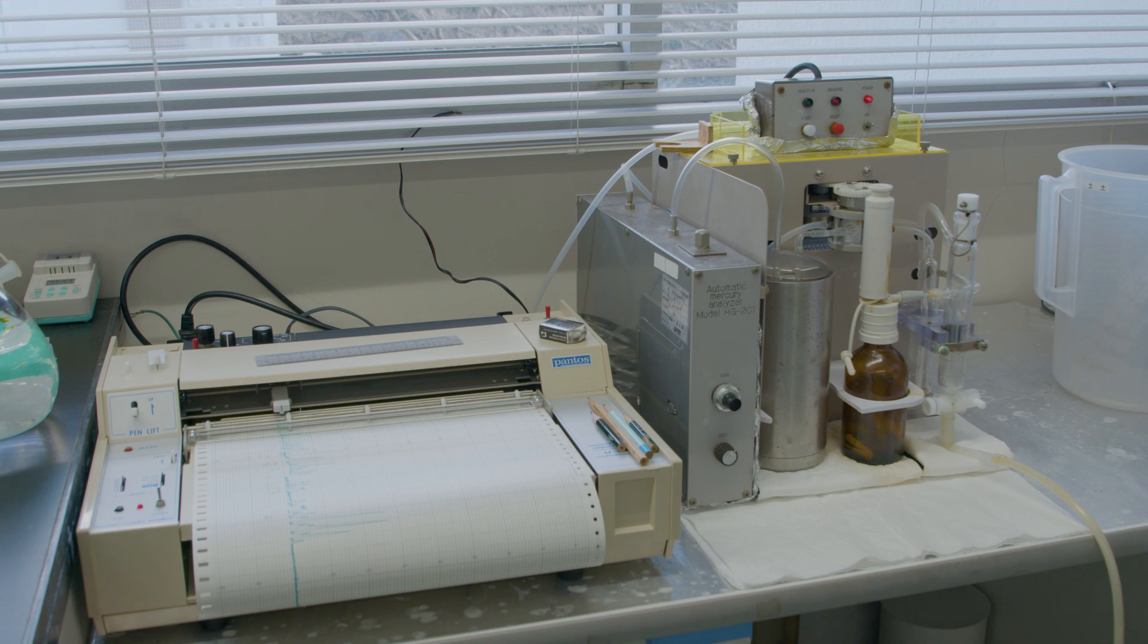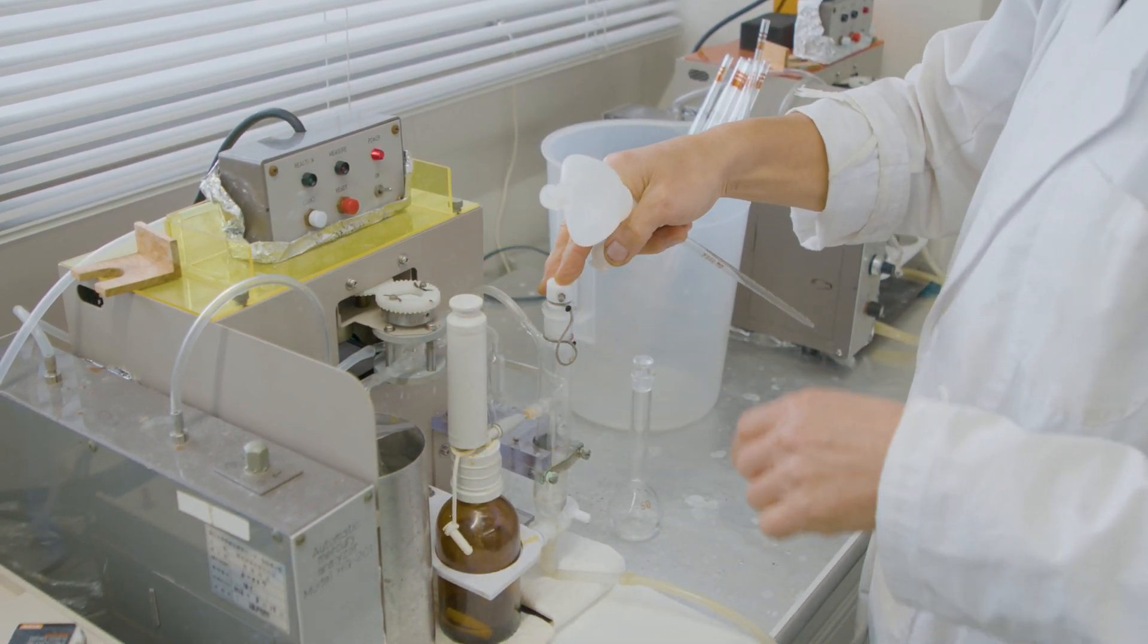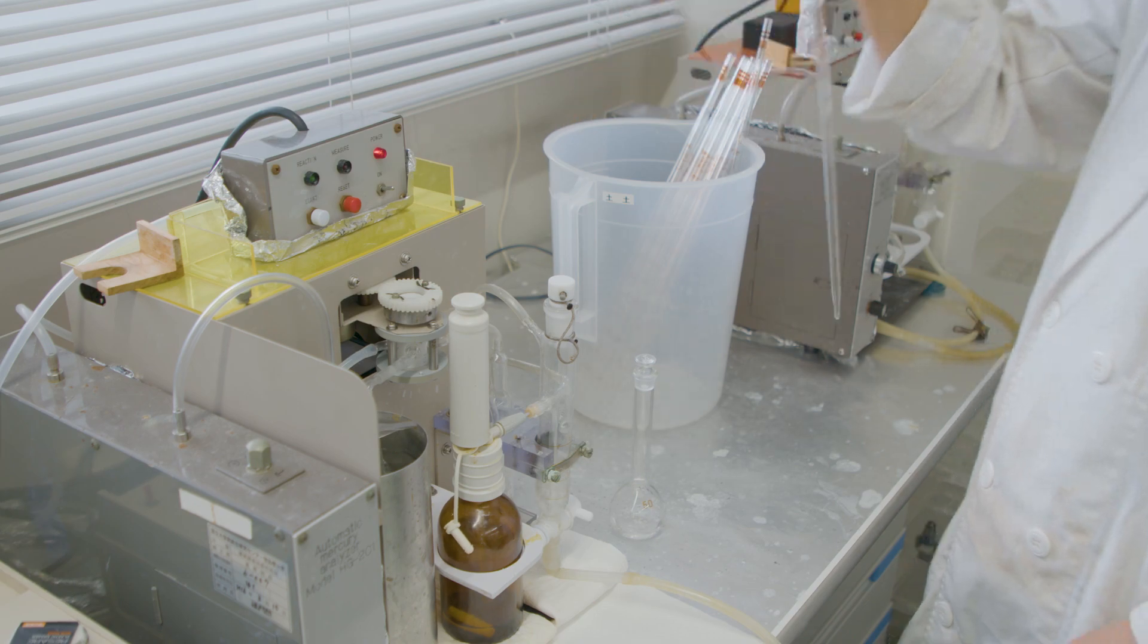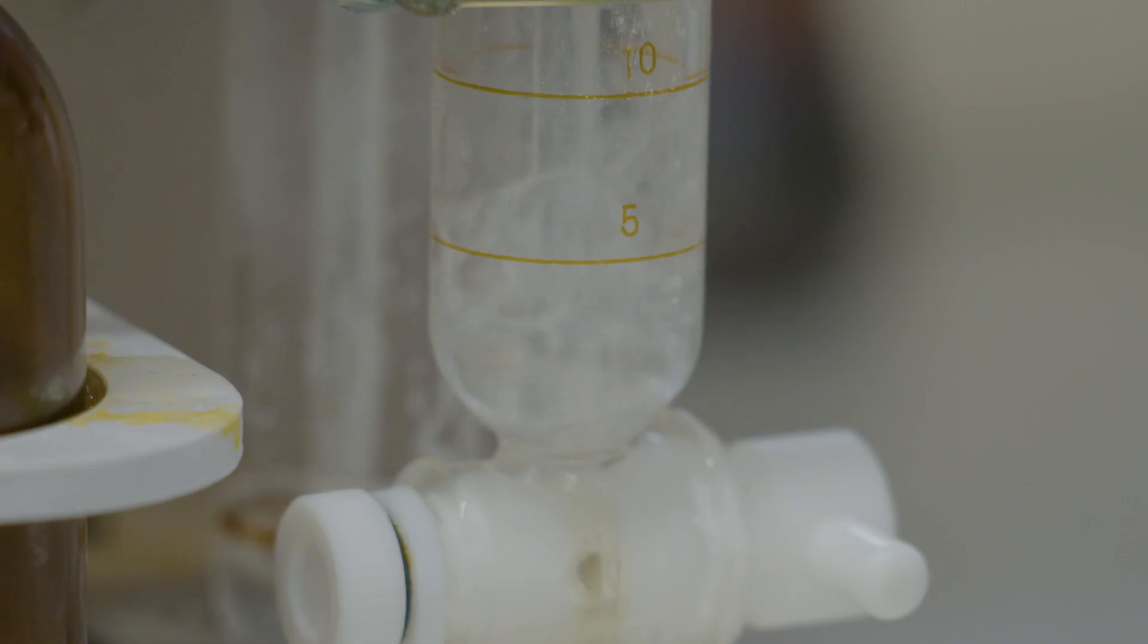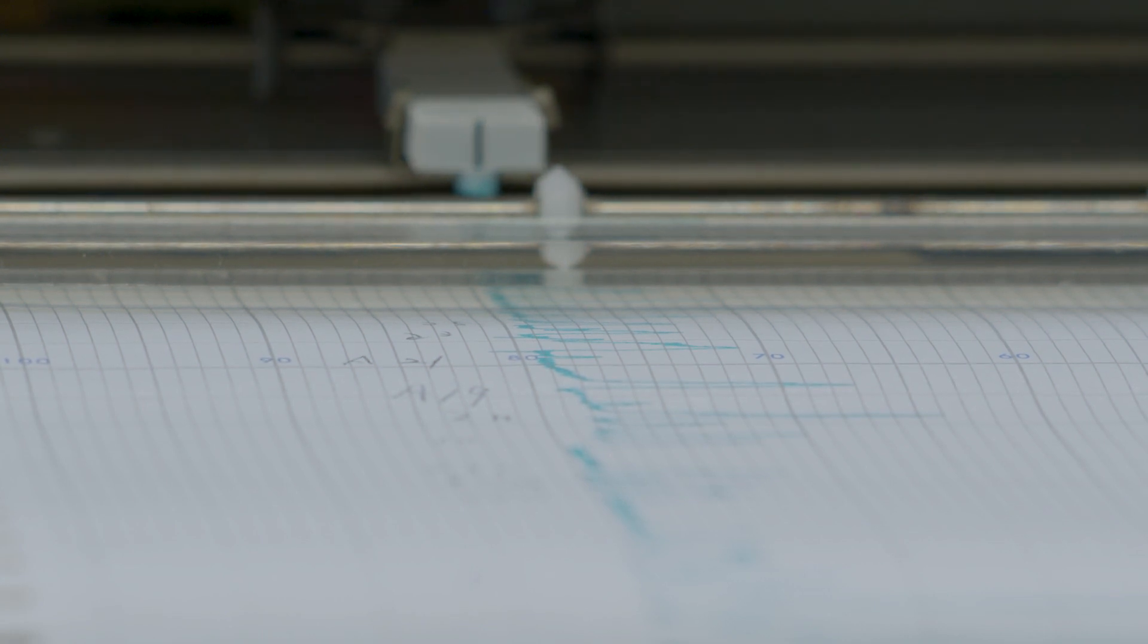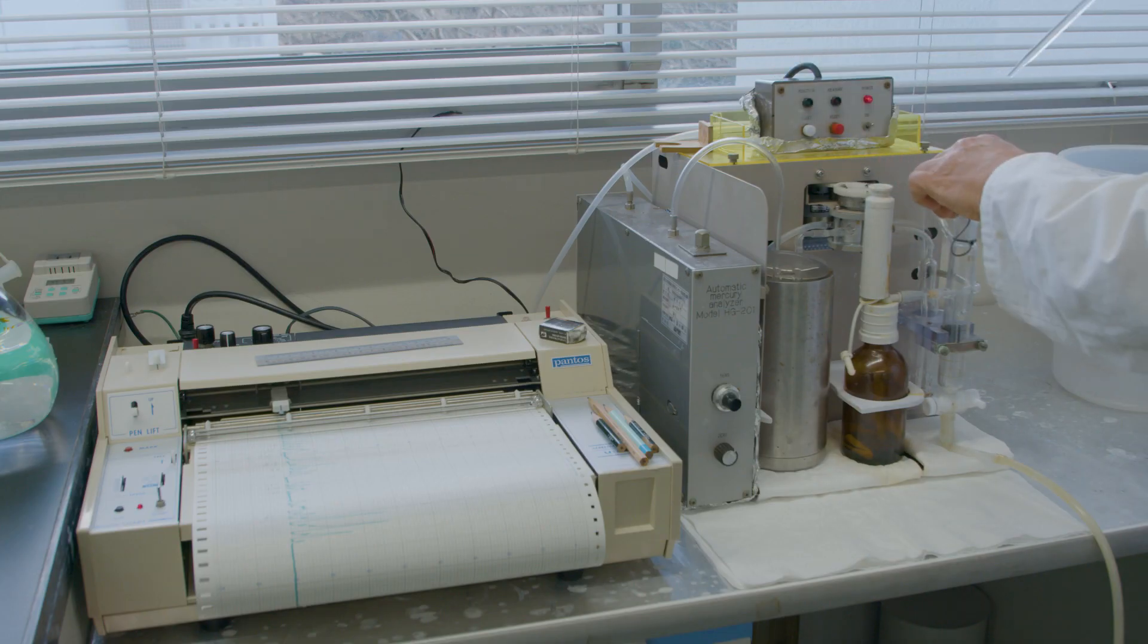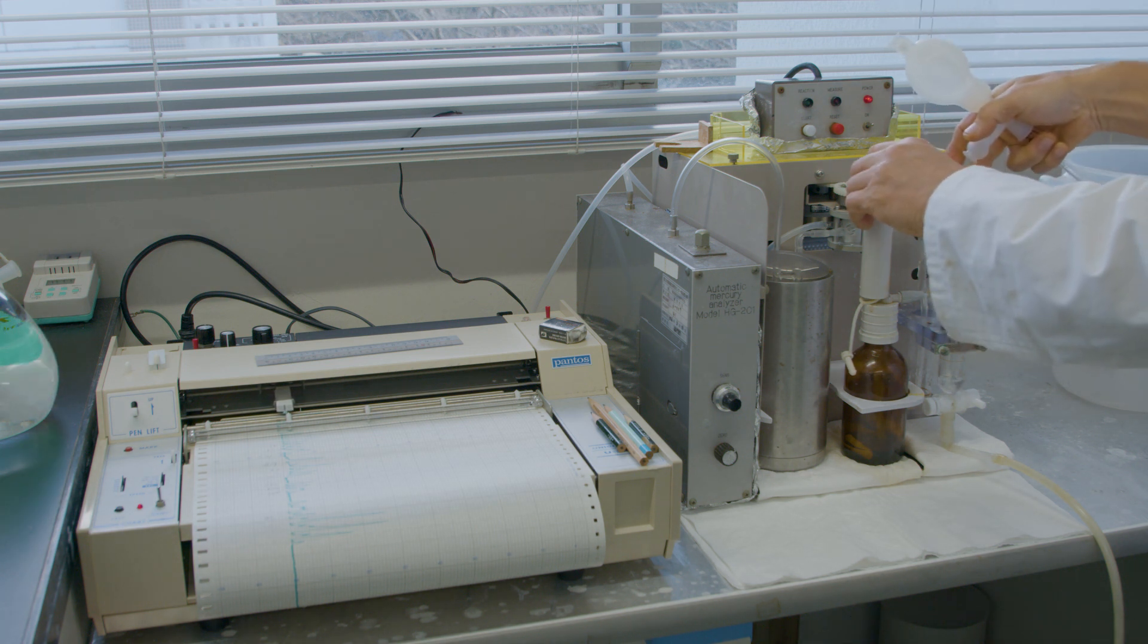CVAAS is widely used to determine total mercury levels in liquid samples. The method involves acid decomposition, reduction, and vaporization, followed by measurements by CVAAS. Both the US EPA and Japan have adopted this method to analyze mercury in wastewater. This technique requires only simple instrument maintenance, is recommended by the NIMD, and is included in the World Health Organization's standard operating procedures for assessment of prenatal exposure to mercury.